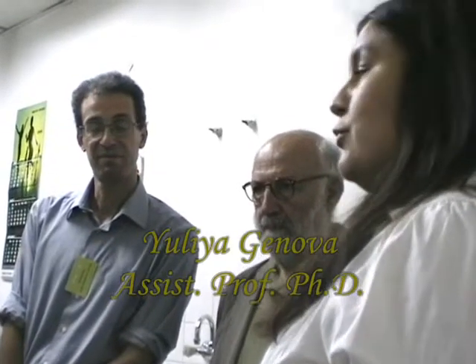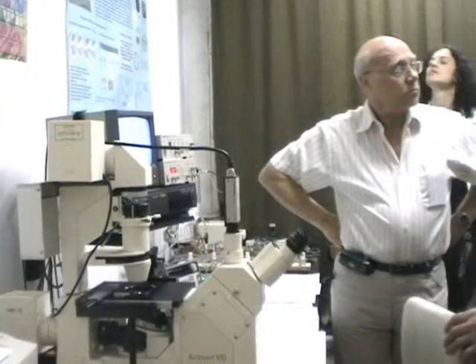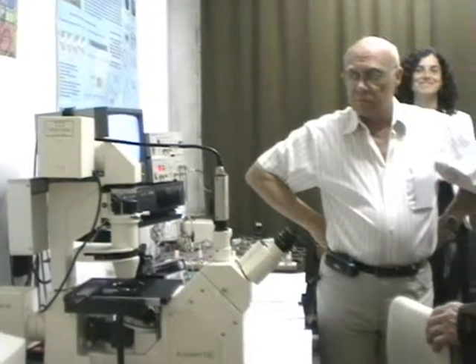Using this technique, we have two main achievements of our laboratory. One is that we improved the technique by adding a stroboscopic illumination, which permits us to register a momentary picture of the shape. It permits us to measure the instant picture of the shape of the fluctuating vesicle. And also we have homemade software for data acquisition and data processing.